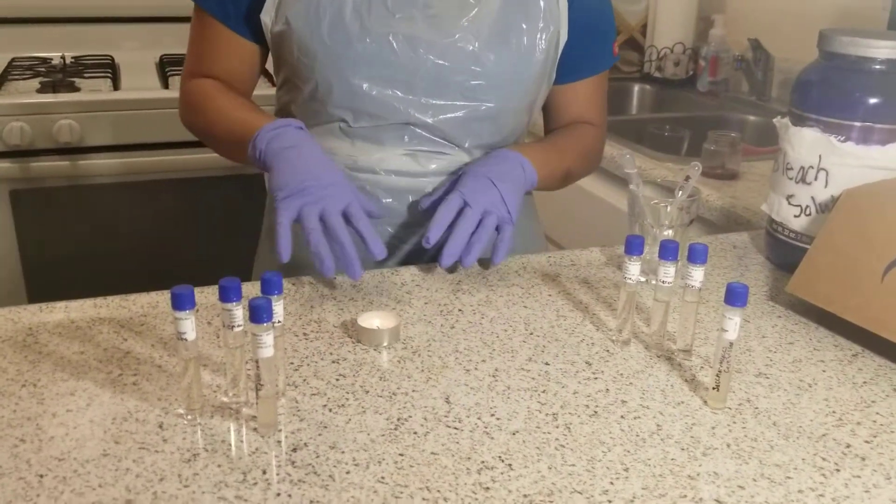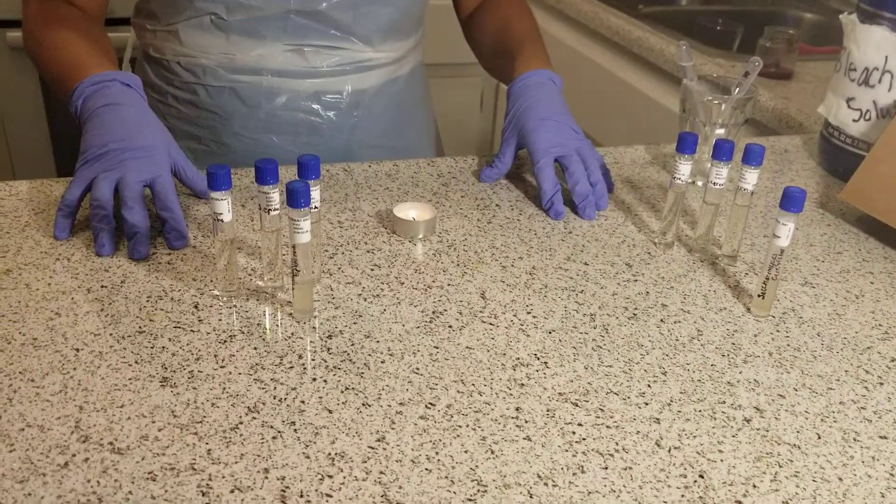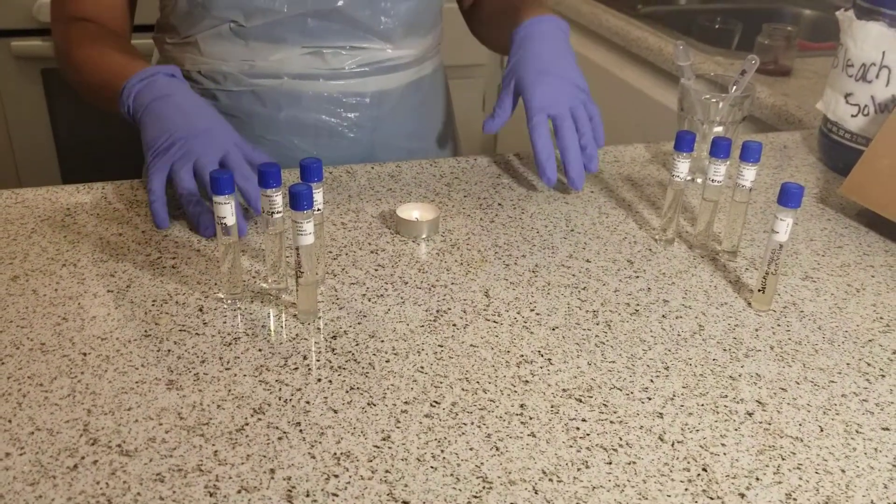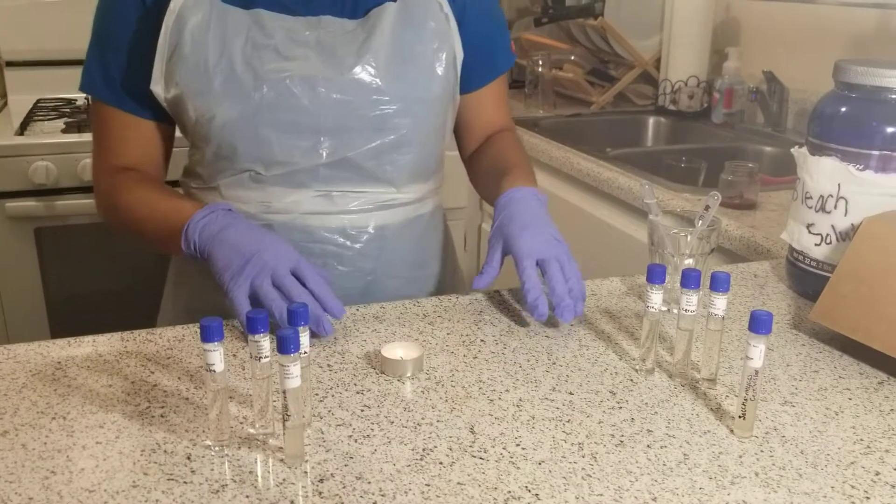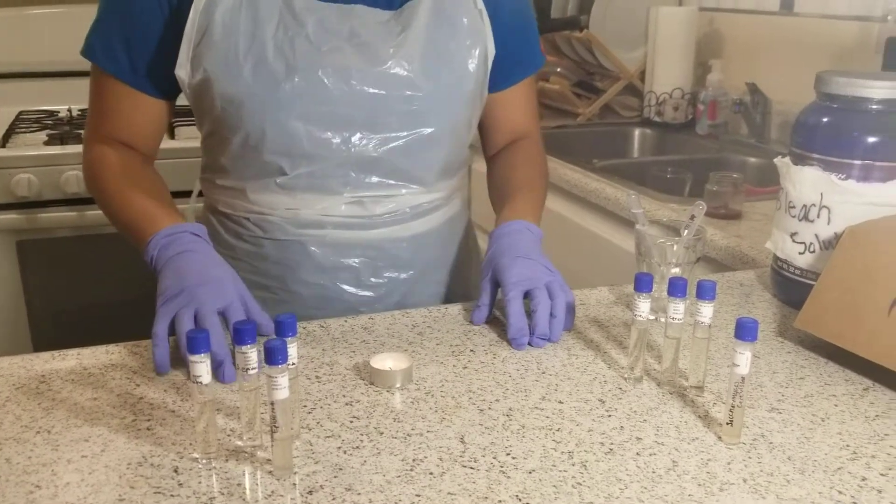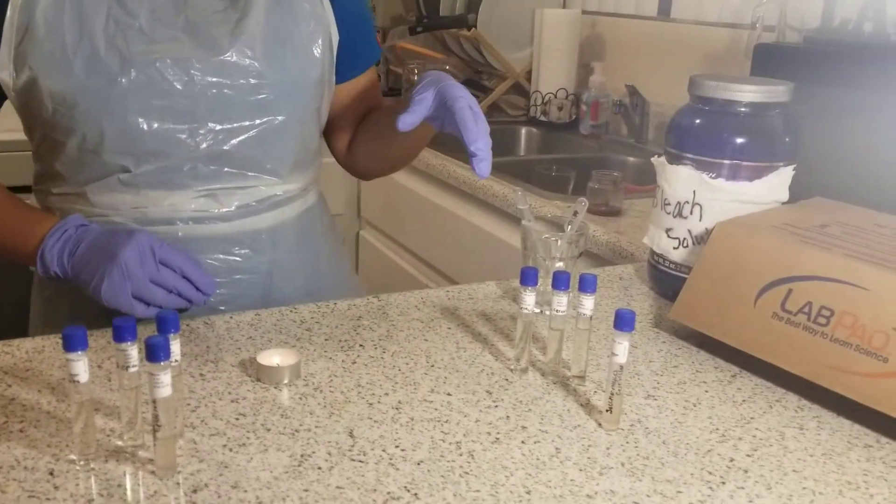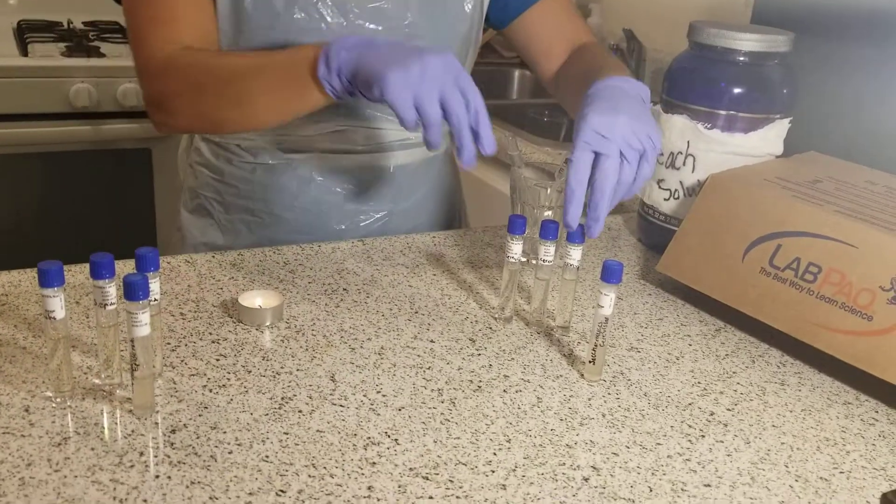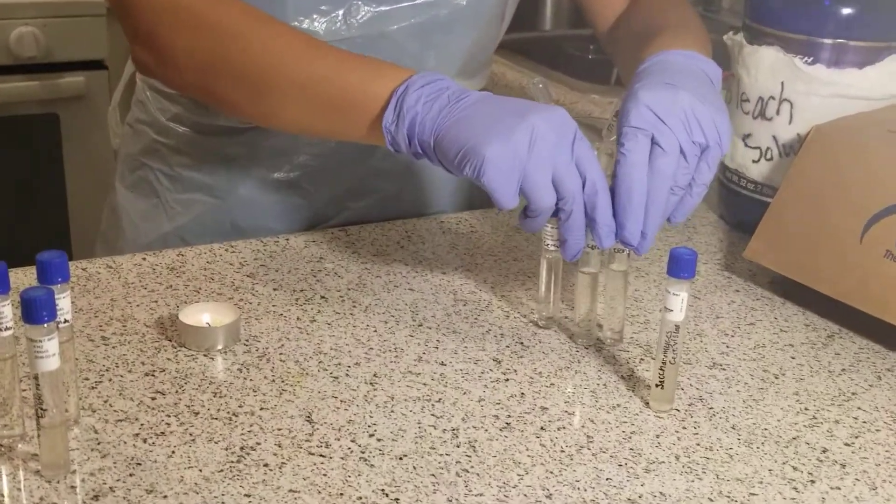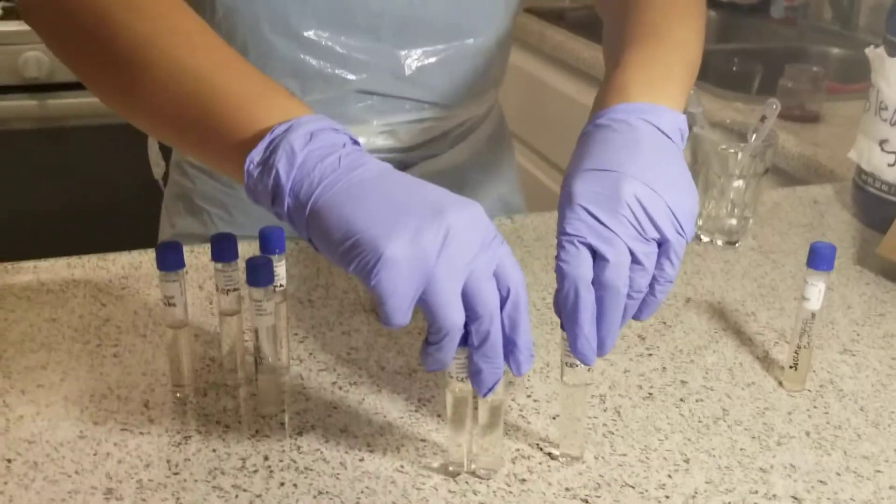I already cleared the work surface area and gathered all of my materials. I disinfected the area with 10% bleach solution. With the permanent marker, I labeled all of my sodium chloride tubes.